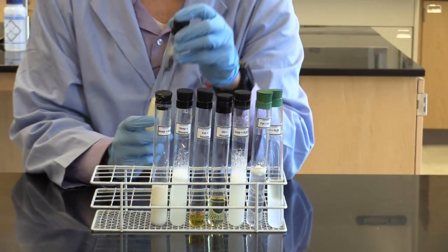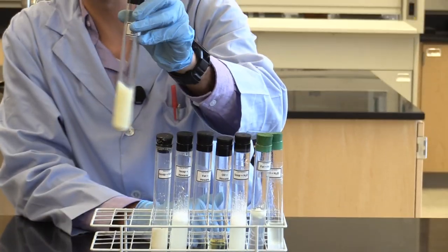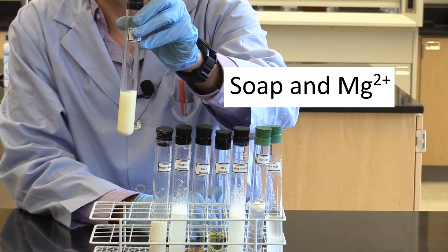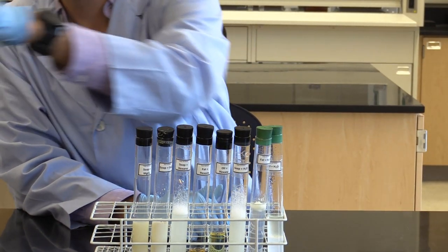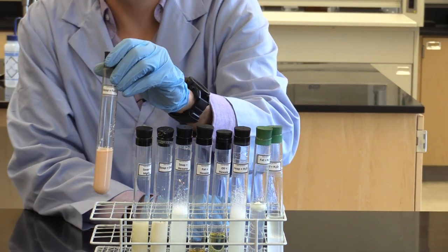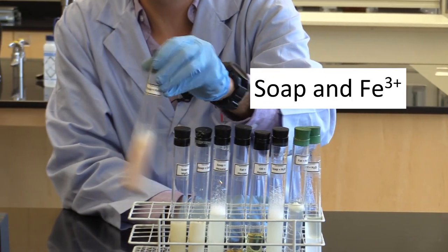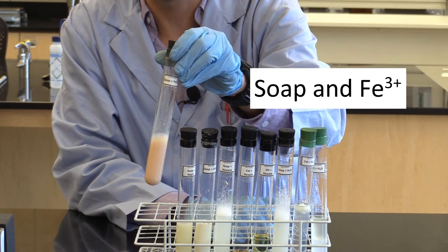Next, we have soap that contains magnesium ions. It also forms a white mixture. Finally, here is soap mixed with iron 3 ions, which is extremely insoluble, forming a milky red mixture.